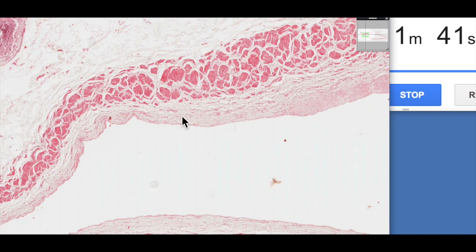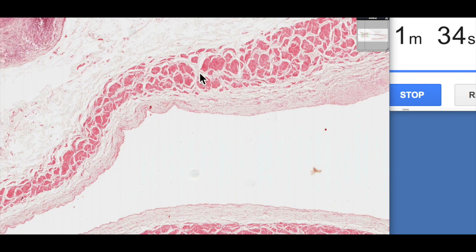Again we can see the tunica media is largely just connective tissue. We've got a few squiggly smooth muscle cells but then most of the smooth muscle exists in the tunica adventitia and it's very unique to the vena cava.